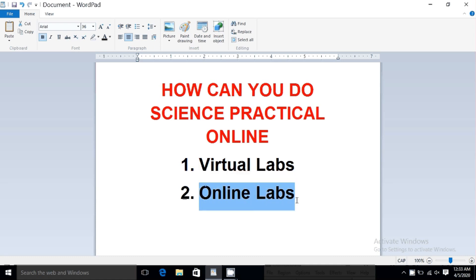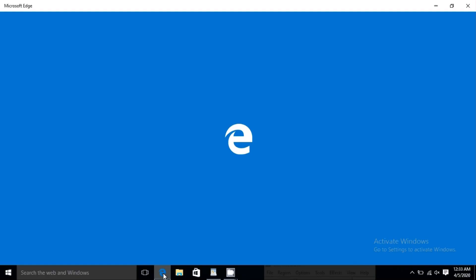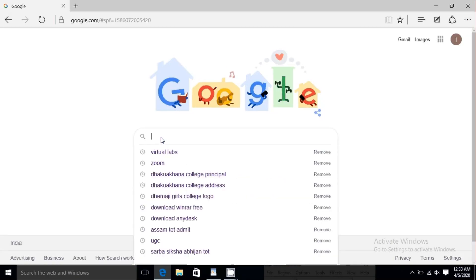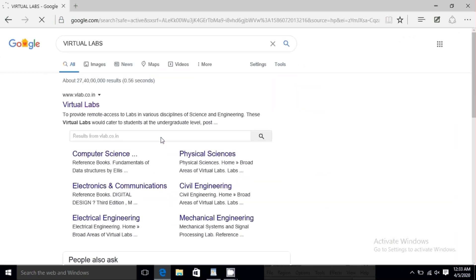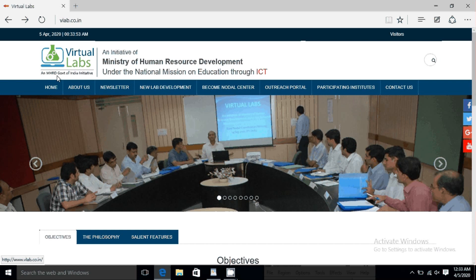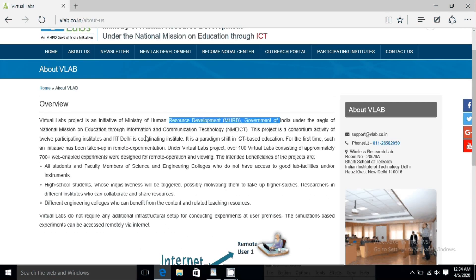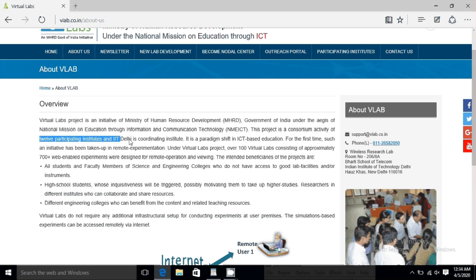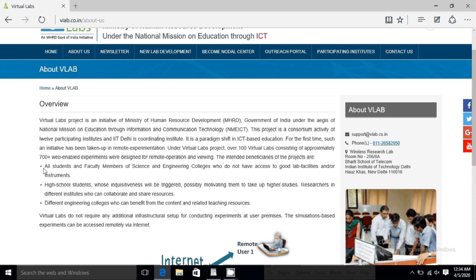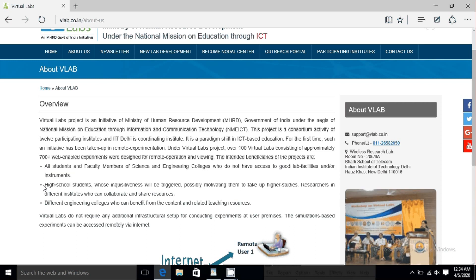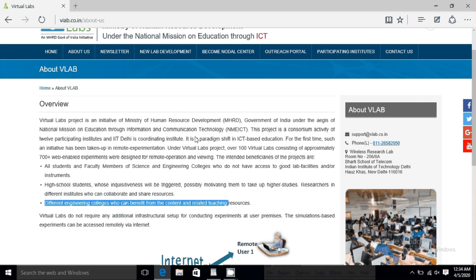What you have to do is just login through your Internet Explorer — I'll suggest Internet Explorer for this platform. Once you go through Internet Explorer you will get the Virtual Labs platform. When you click Virtual Labs you will see the entire platform. It is a project under the Ministry of Human Resource Development through NMEICT, a very big project under the Government of India, basically for college and engineering students, faculties, and research scholars.